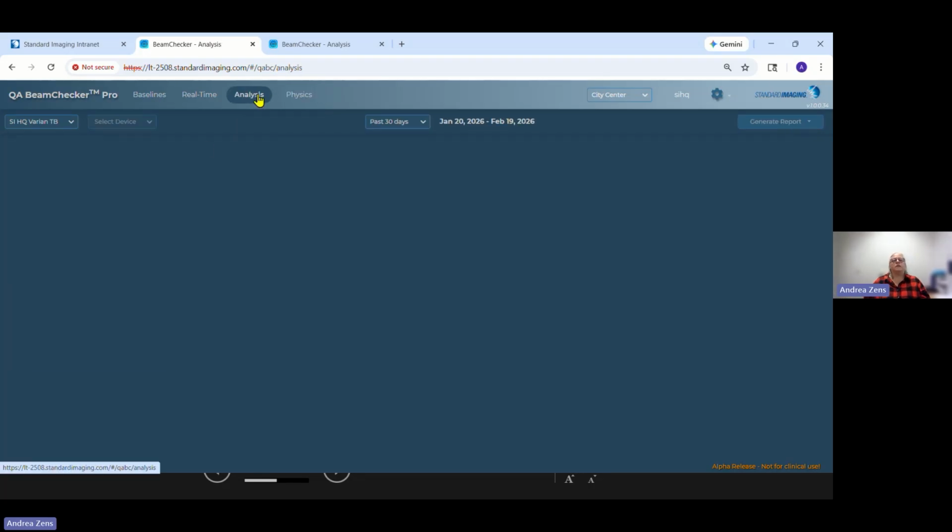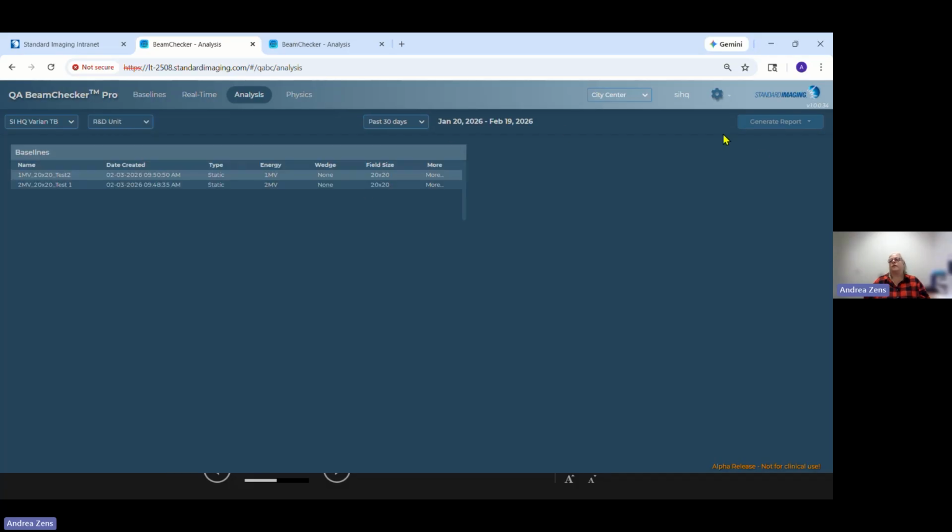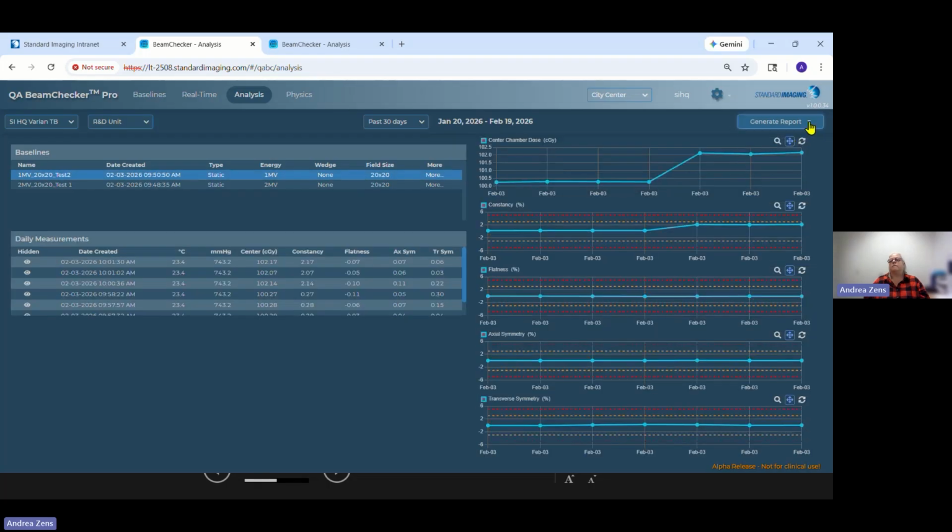So let me hop back to the analysis page for a moment, just to show you that this is also where you would generate a report. And of course, we have CSV or PDF reports. And that, I think, is everything I really wanted to show you in the software.